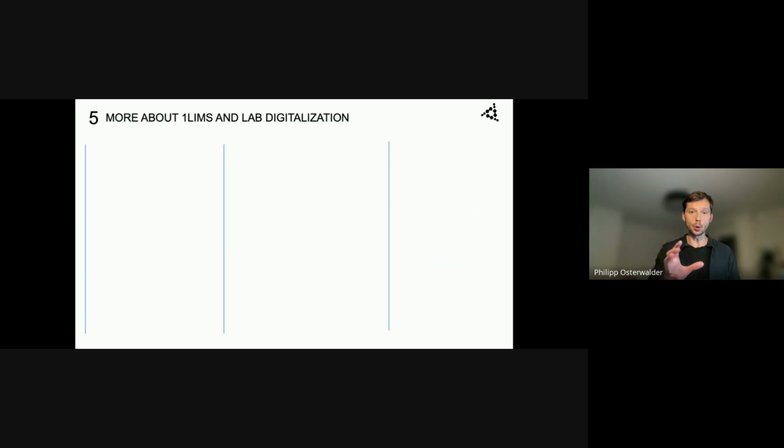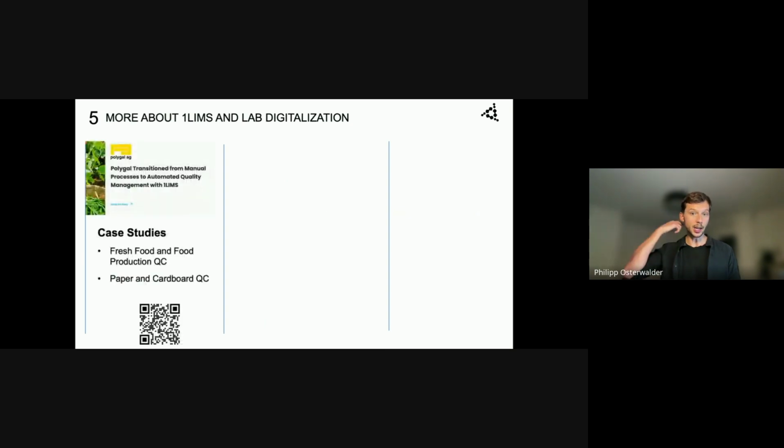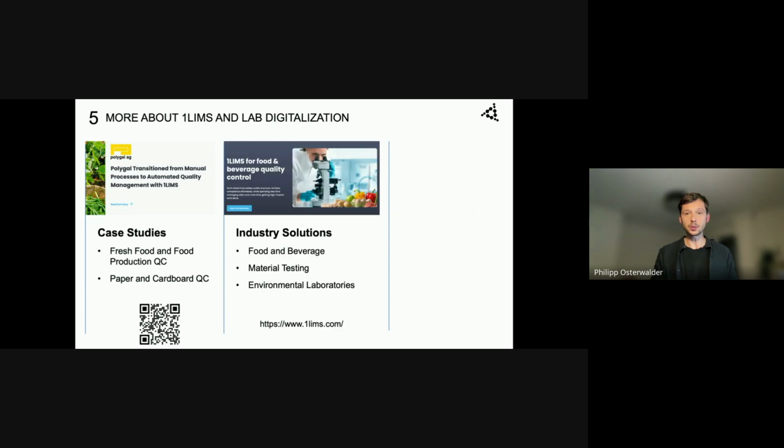If you want to know more about this specific information about laboratory and quality digitalization and automation, just check out our case studies on our website. We have a lot of different customers based on different industries. So it's worth it to take a couple of minutes to fly through these different case studies and also blogs for industry solutions like food and beverage or material testing or even environmental laboratories.